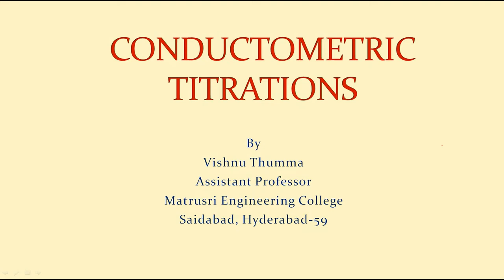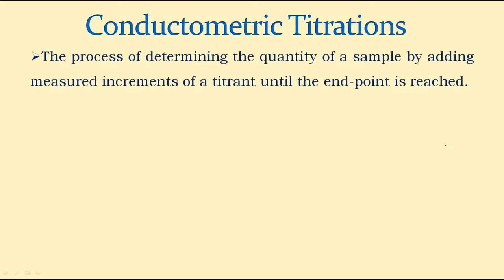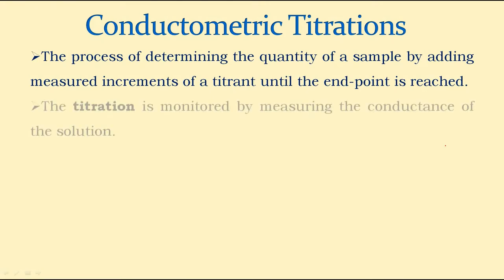Dear students, in this lecture video, we discuss one of the analytical techniques in chemistry laboratory, that is conductometric titrations. What are conductometric titrations? The process of determining the quantity of a sample by adding measured increments of a titrant until the end point is reached, the titration is monitored by measuring the conductance of the solution.